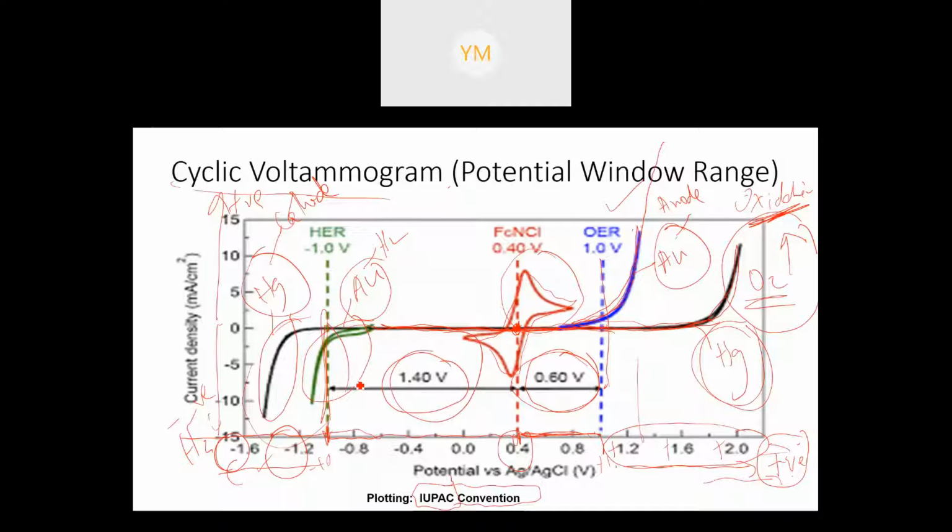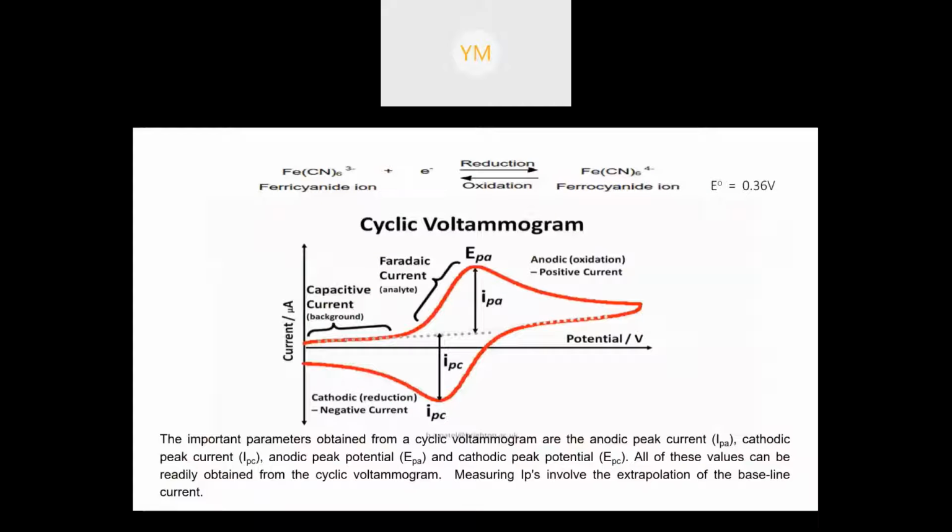Okay, the large overpotential for hydrogen evolution on the left, and also the overpotential on the right for oxygen evolution. Sorry. Okay, look at this. This is very common. If you are an electrochemist, in order to check and calibrate your instrument's potential state, whether it is okay or not, you should do this scan, cyclic voltammetry.